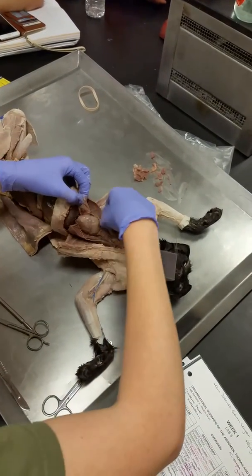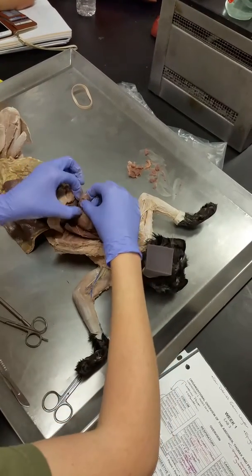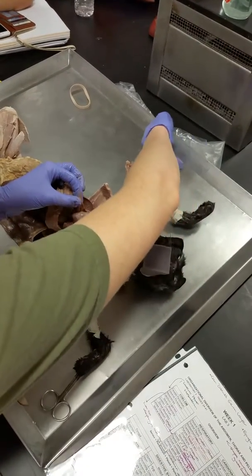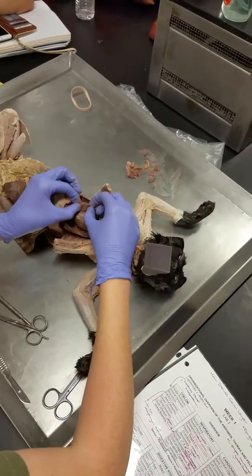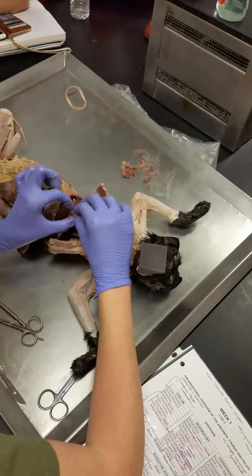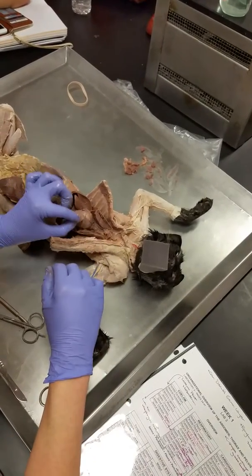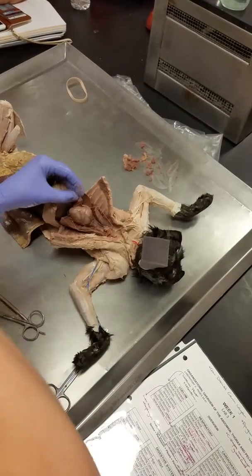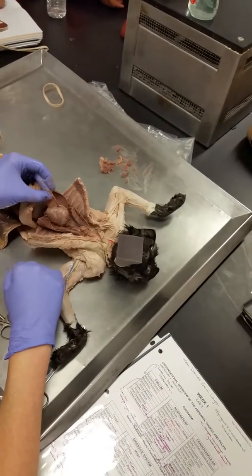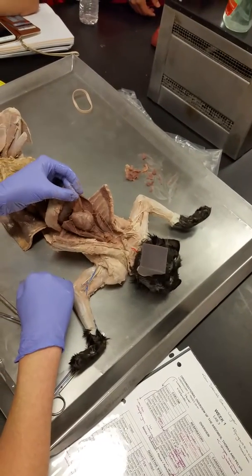Okay, so this pericardium that I've taken off here, this is called the fibrous pericardium. So it's really thick. Fibrous pericardium is nice and thick. Okay. So it's just the thick part that you actually have to cut through. And then there's another part of the pericardium that's called the serous pericardium.